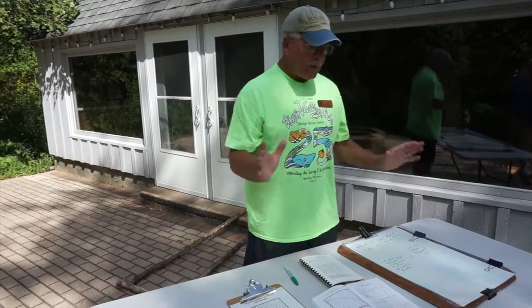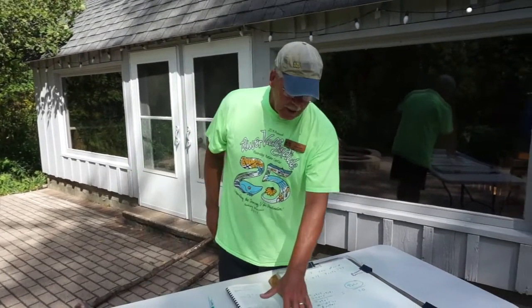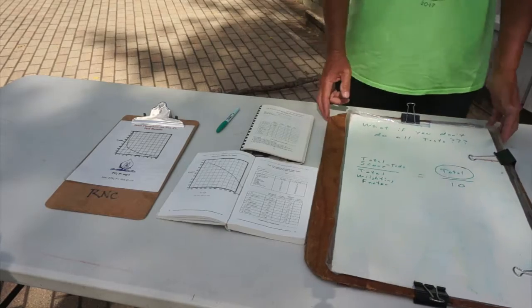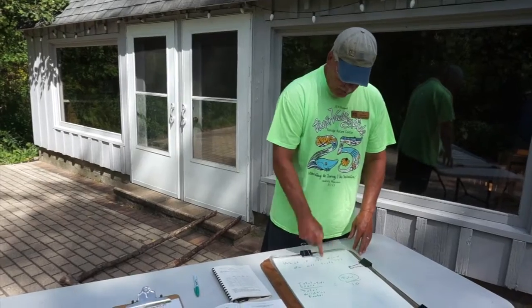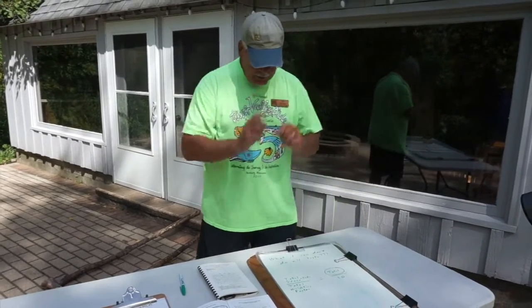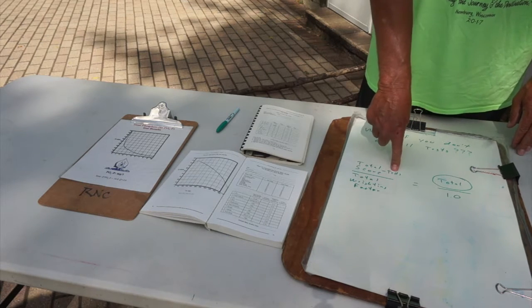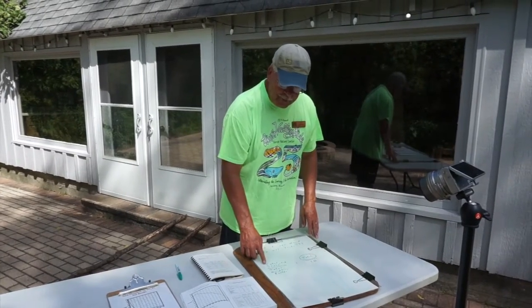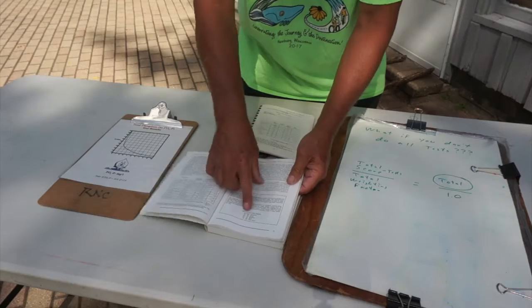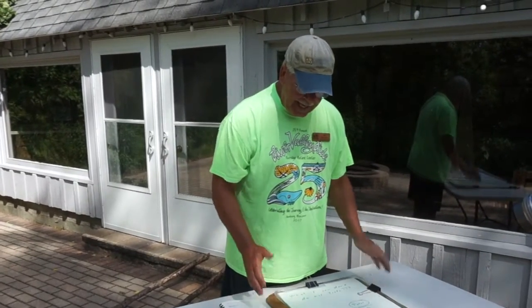Now, I'm going to show you one last thing. If your teachers can't do all 9 tests, I want you to go over to this board and we'll take a look here. What if you don't do all of the tests? Here's what's going to happen. You're going to come up with a total score down here, but it's going to be missing a test or 2 or 3. And so this number is going to be lower than it really should be. And then when you go back to that page that I showed you before and you compare it here, your river's going to look bad. How can we normalize that? How can we make that something that makes some sense? Here's how you do it, guys.